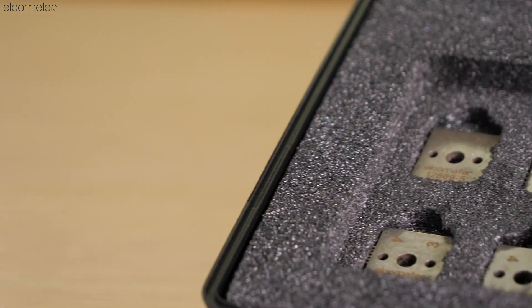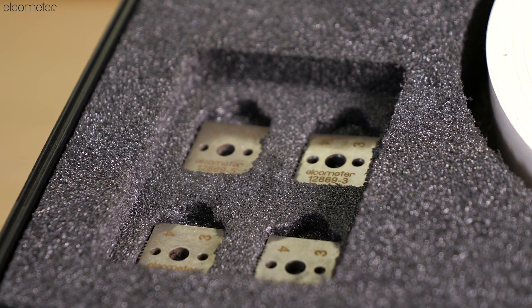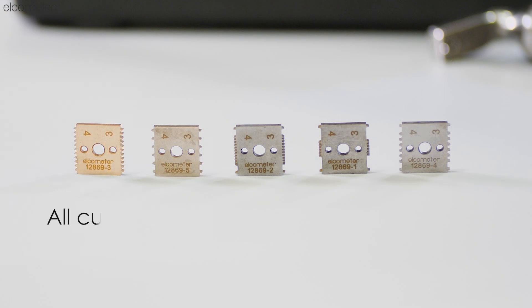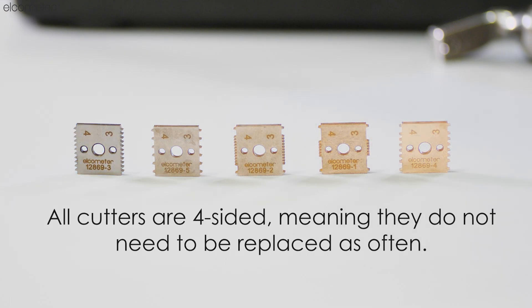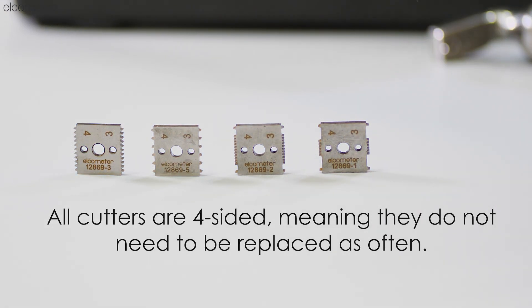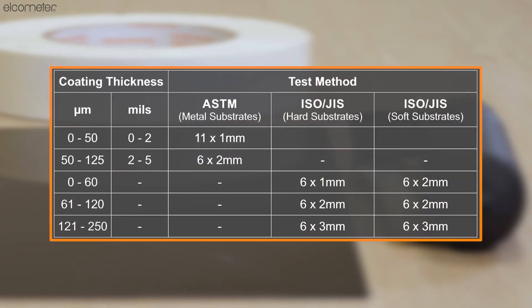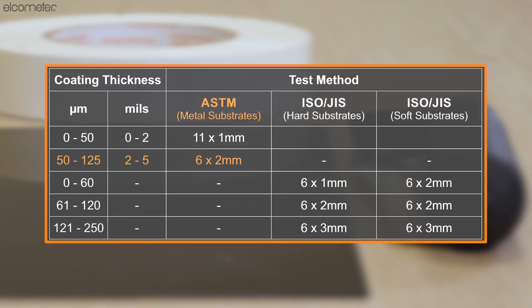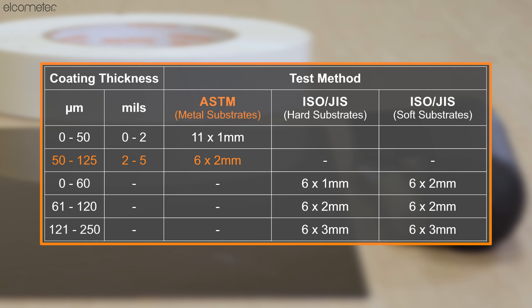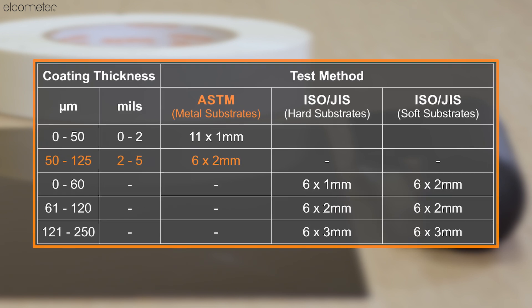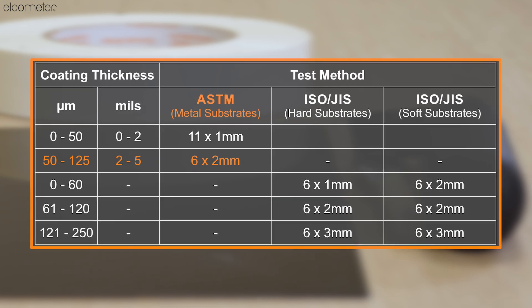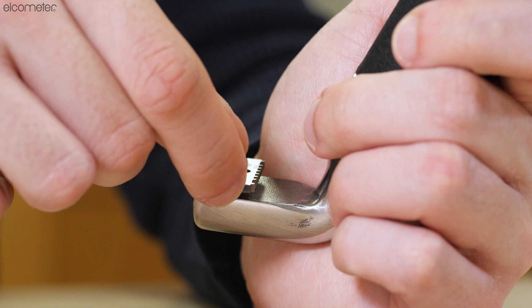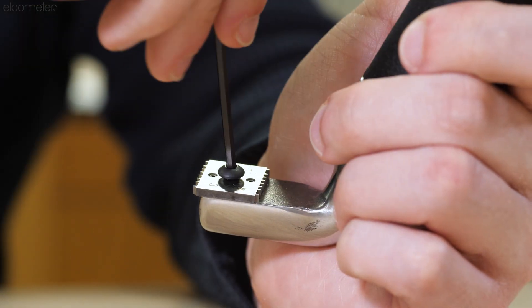To begin, you need to ensure that you are using the appropriate cutter blade. Your choice of blade will be informed by the substrate type as well as the test method being used. As in this example, we are working towards ASTM standards and using a substrate with a coating thickness of 100 microns or 4 mils, we will be using a 6 by 2 millimeter cutter.